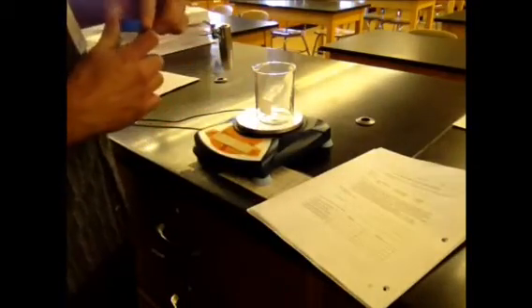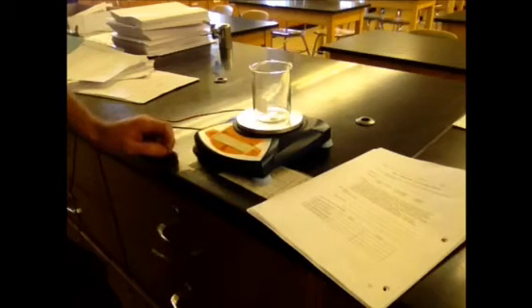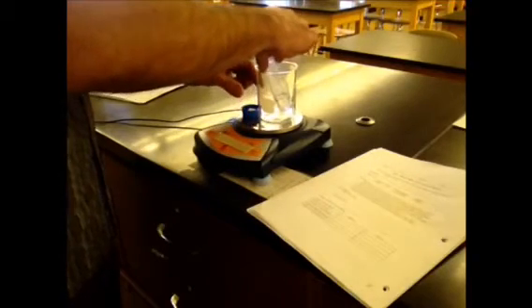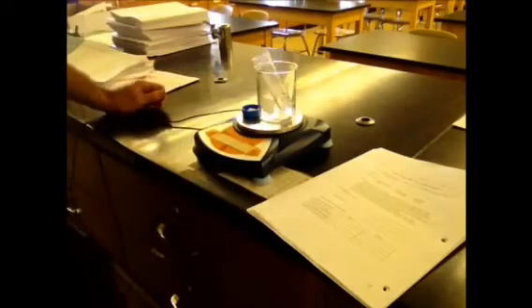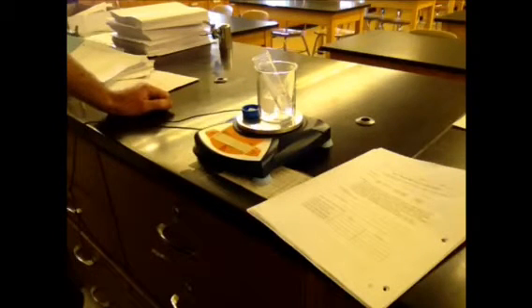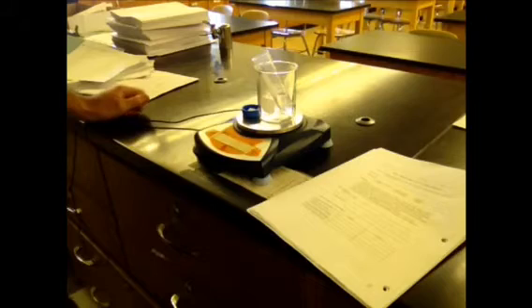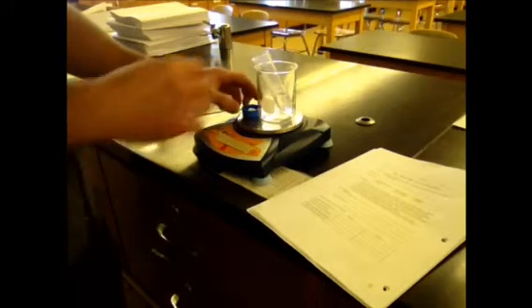There are two different ways you could do this, and it depends on if we have enough balances. One way is you put the beaker on the balance and you tare it so it's reading 0. And then you put the vial and the lid how they are. You don't want the cap on the vial yet. And you would write down the mass for that, and then you would compare that when you're done with the reaction. Now, if you have your own balance, what you could do if you wanted to is put everything on there and hit 0. It depends on how many balances we have.